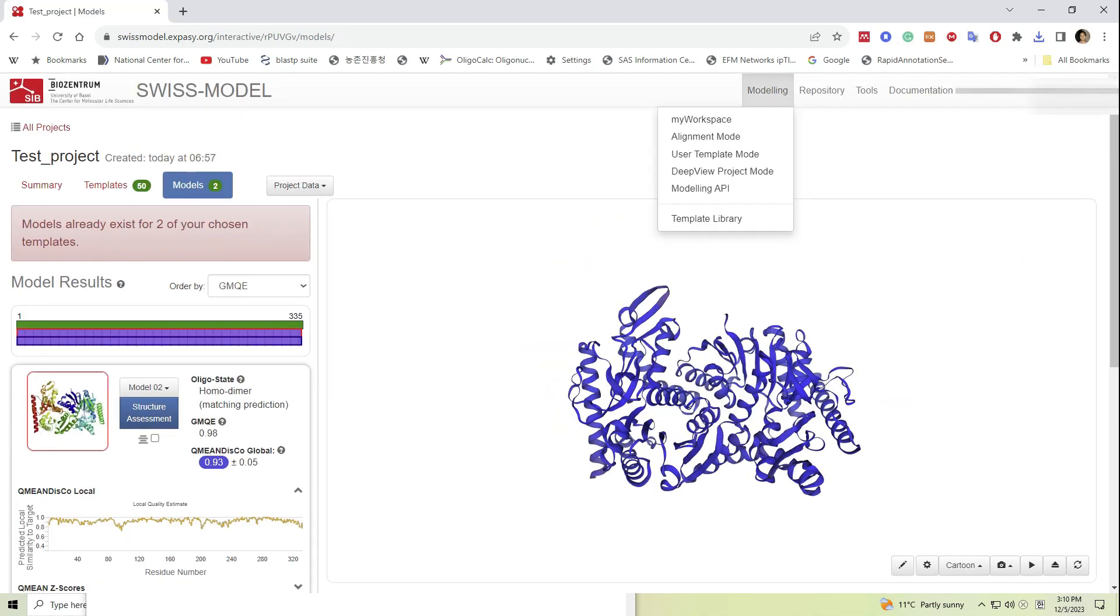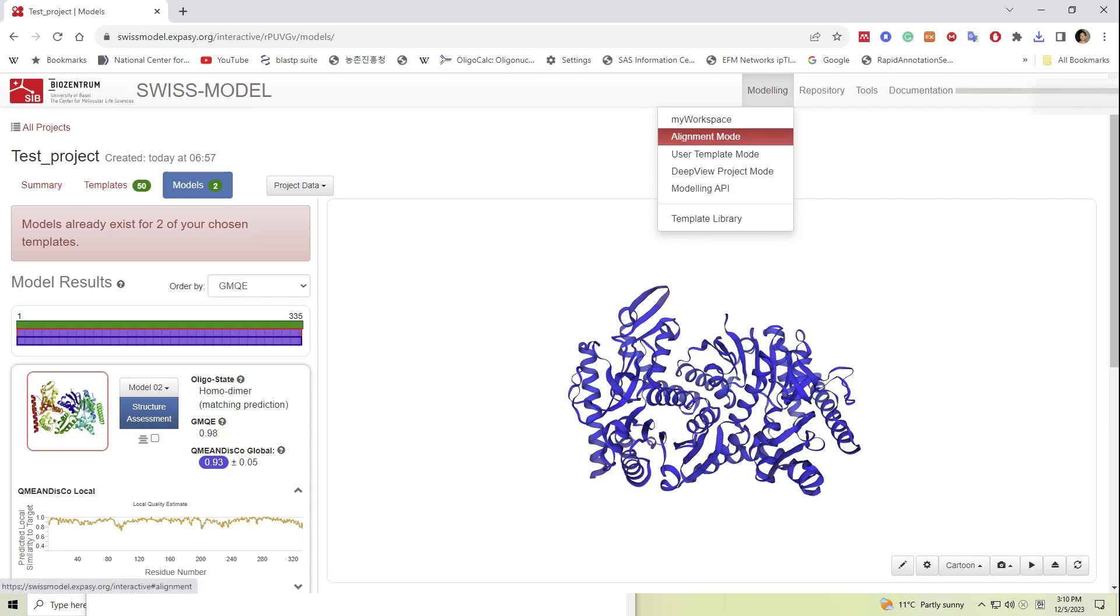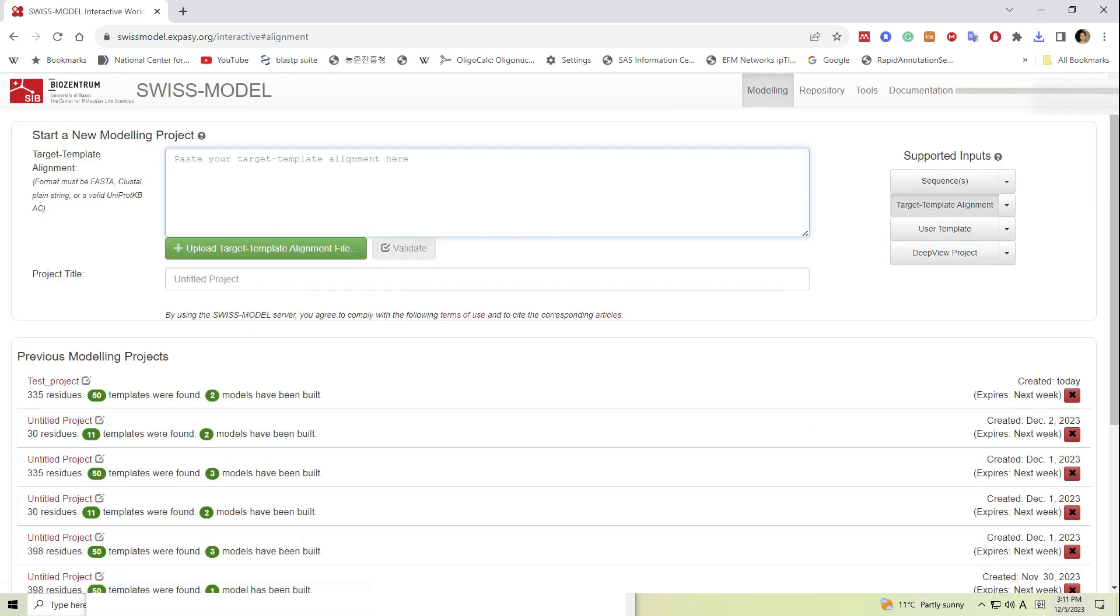If we check the top right menu, we can see several other options for model building. For example, if you have a preferred template, we can provide the template or the alignment as an alignment file to construct the model without spending time on template search.